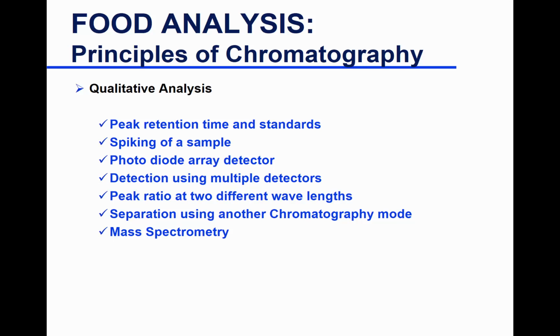So you can combine or put detectors in sequence and get as much output as possible so you can get an identification of what you have. If some compounds absorb light at the same wavelength, and you put another detector next to it, then it will have a different signal. Then you can differentiate them that way.